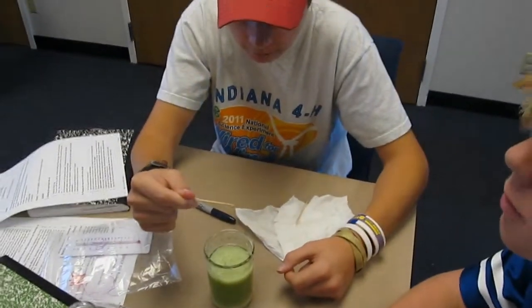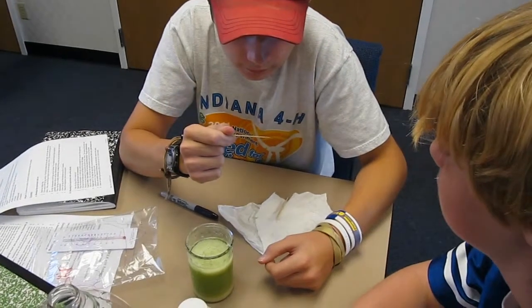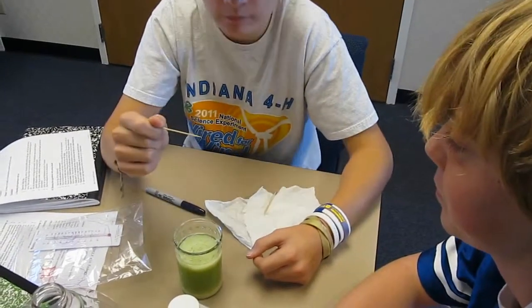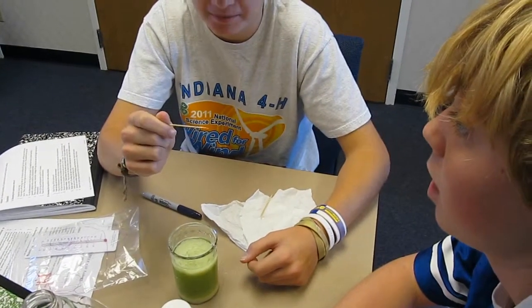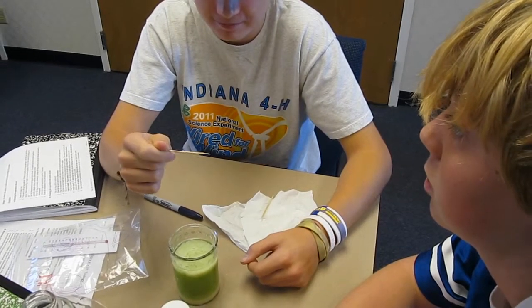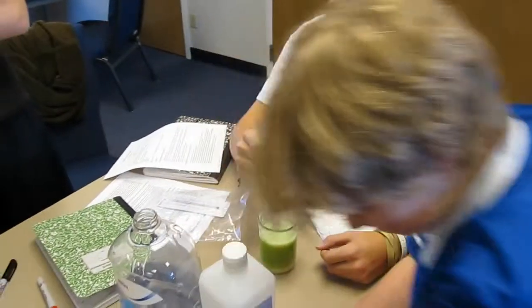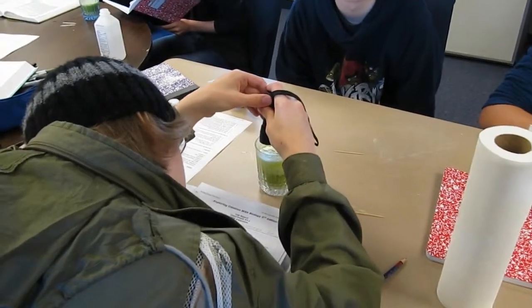It looks like a string twisted around your toothpick. There is a string twisted around my toothpick. Yeah, it is. Those are germs. You got DNA! And if you would take the DNA out of a single cell... Does it look like you thought it would? I thought it would be like under a microscope — this little round thing. If you take all the DNA from your body and stretch it all out, it would go from the earth to the sun. I'm thinking it's seven times. It's crazy!